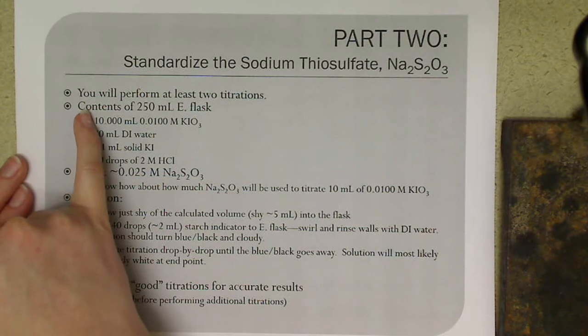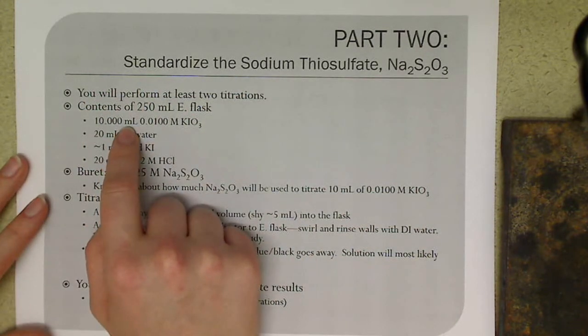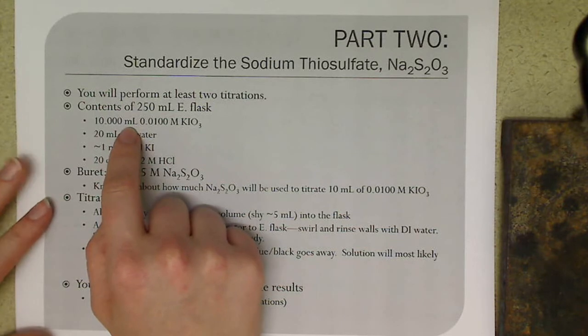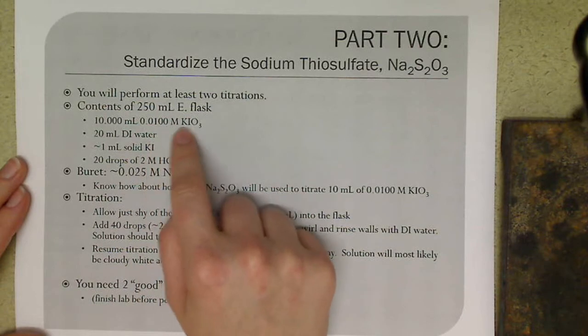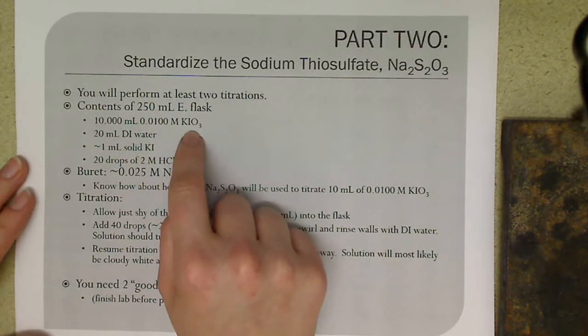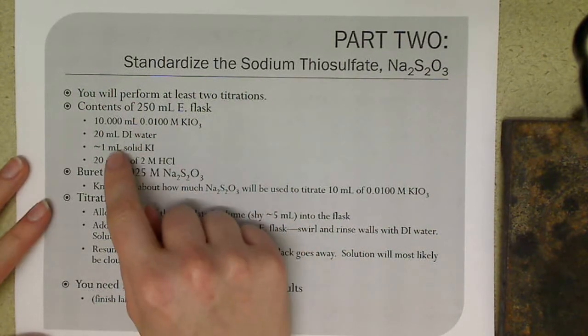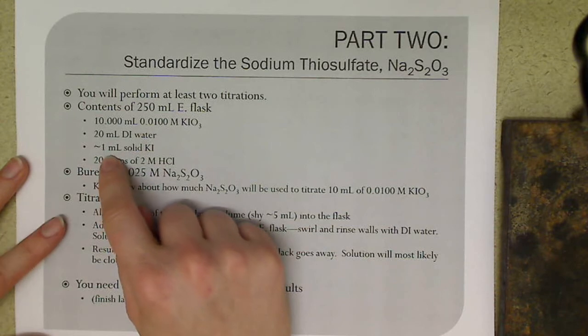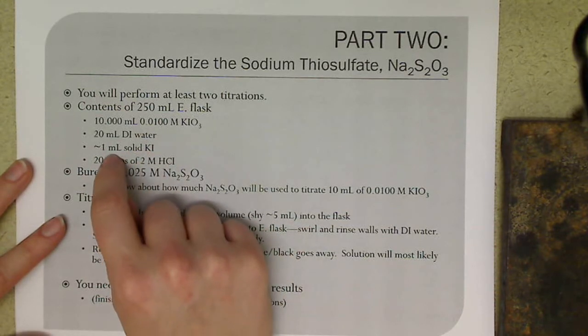In your Erlenmeyer flask, you're going to dispense 10.000 milliliters, so from a volumetric pipette, of your 0.0100 molar potassium iodate. So this has been prepped for you. You're going to also add about 20 milliliters of DI water and about 1 milliliter of solid KI. Yes, this is milliliter.